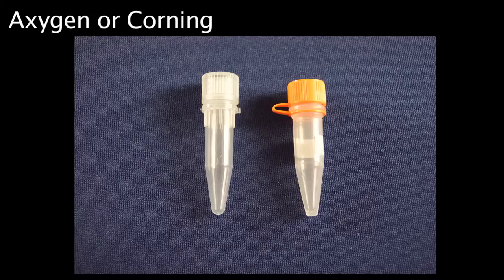BBX24W model Bullet Blenders were designed to be used with conical-bottom, screw-cap microcentrifuge tubes. Use either Axygen brand or Corning brand 1.5 milliliter screw-cap tubes.